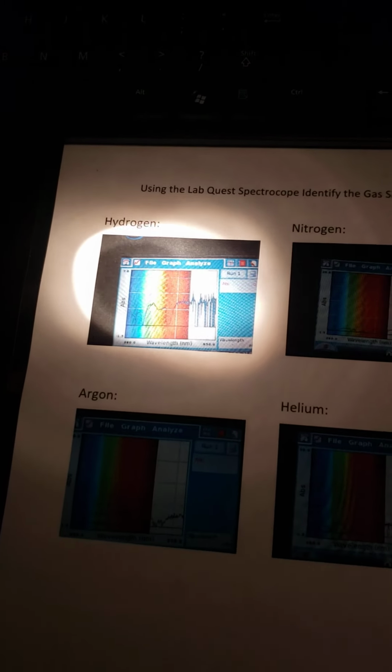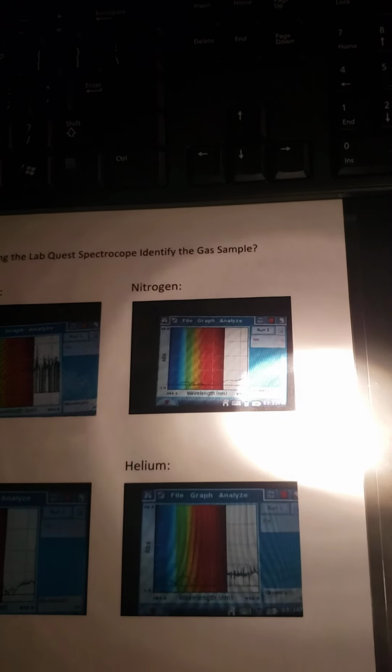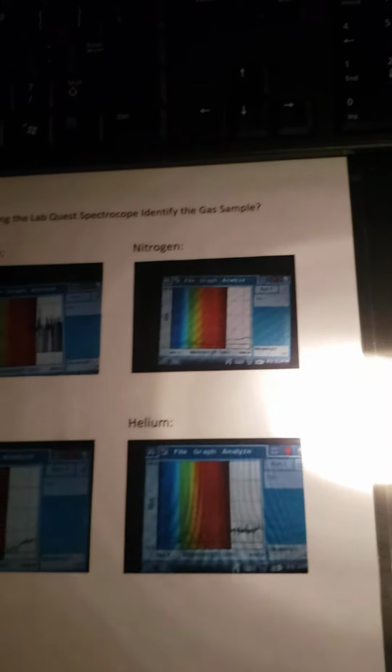Save some time. So I don't know if you can tell, but this is hydrogen, the graph we should have got with hydrogen. This is one we should have got with nitrogen and helium. Okay, and argon. So what we could do is compare the graph on our spectrometer to each of these to identify what this gas is. We find out that this gas is hydrogen.